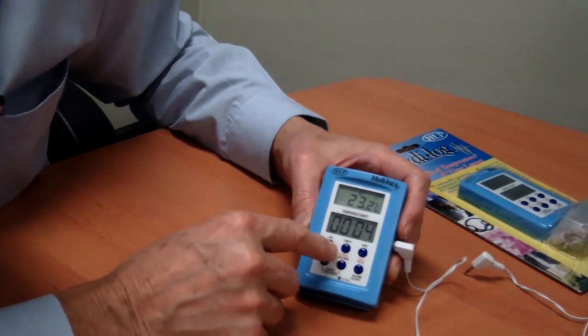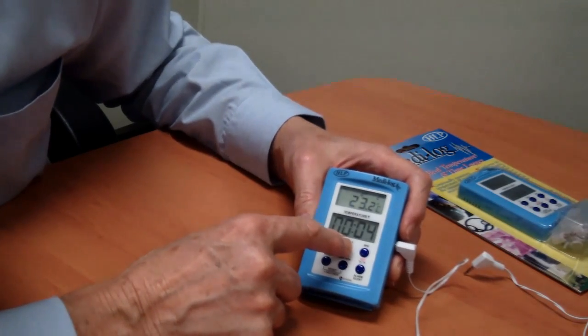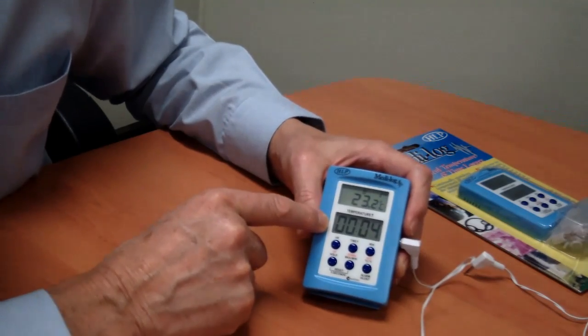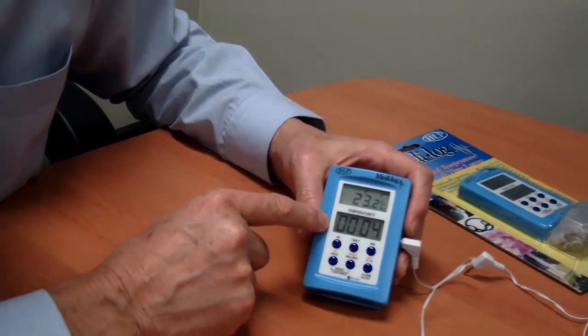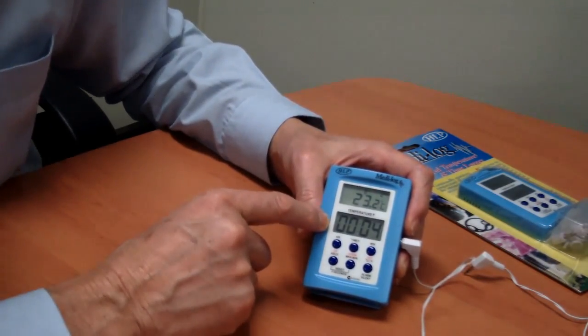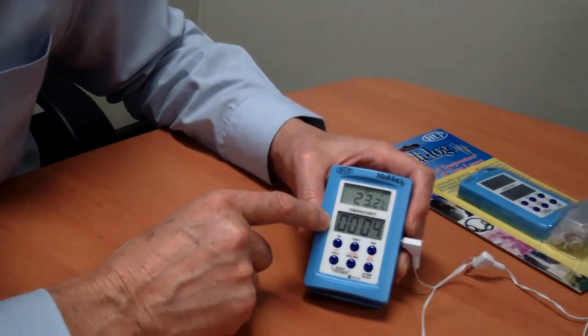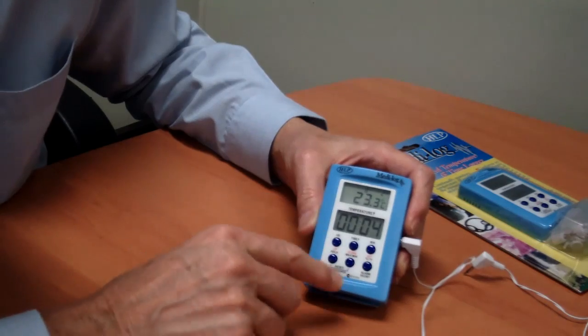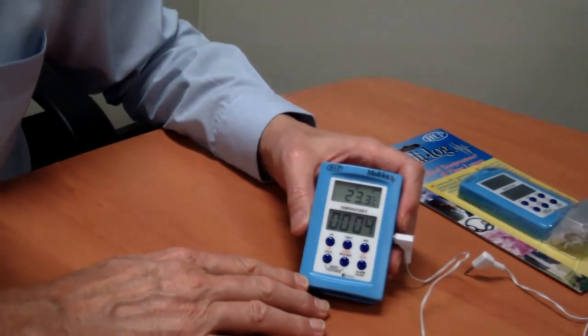You can get a maximum temperature of 23.2 and the time will tell you how long it's been there. That might say two hours and four minutes, or ten hours and four minutes, or just one or two minutes.